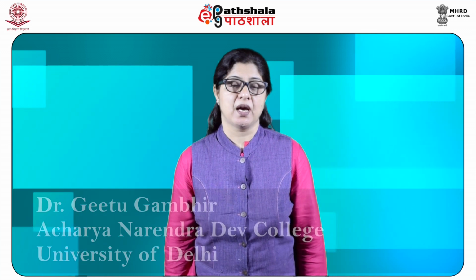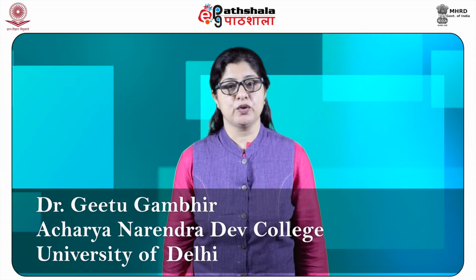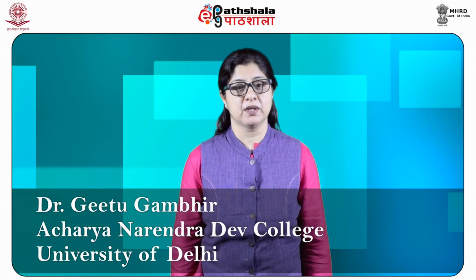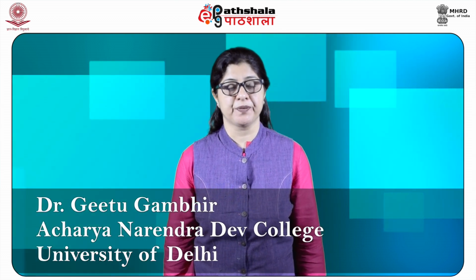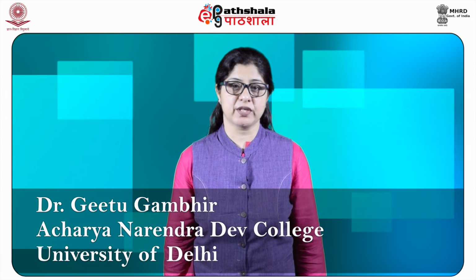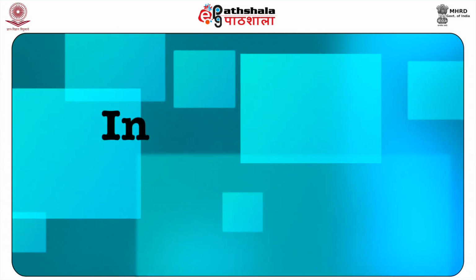Dear students, after studying this module, you shall be able to know about the introduction of ion exchange chromatography, the principle of ion exchange chromatography, some of the exchange techniques, and the applications of ion exchange chromatography.